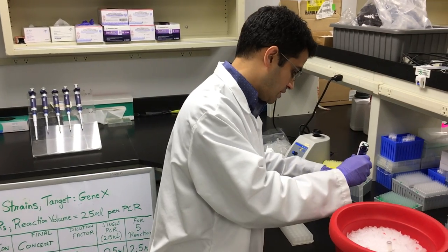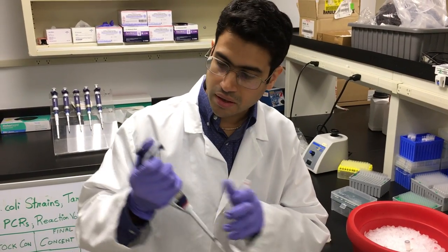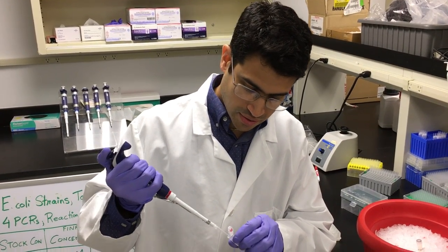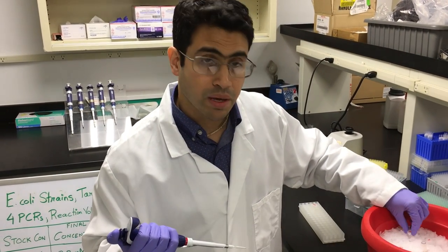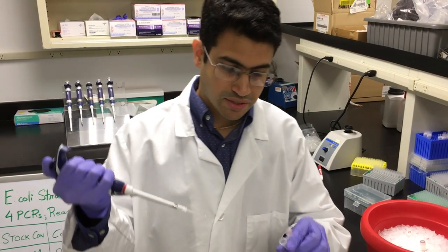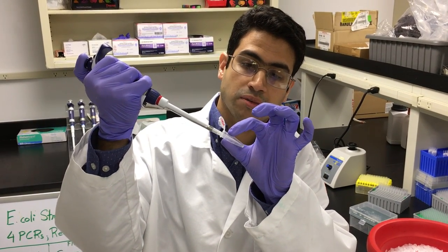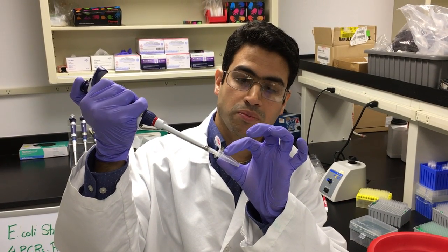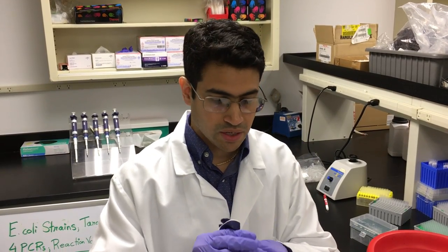The next ingredient I add is the magnesium chloride. I've already calculated the volumes I need of each ingredient. Remember to put everything back on ice because you want everything to stay cool. When adding the next ingredient, make sure that you touch the tip right into the PCR grade water, aliquot, move the tip over to another area of the tube, suck up, and then dispense again. That's how you add the rest of the ingredients.